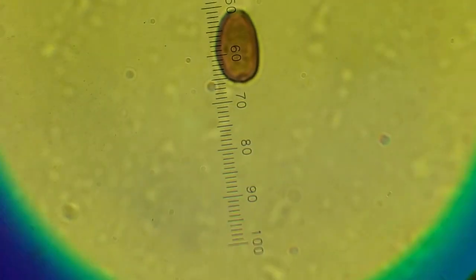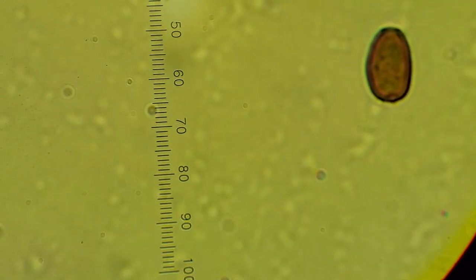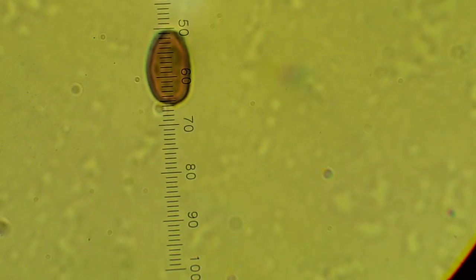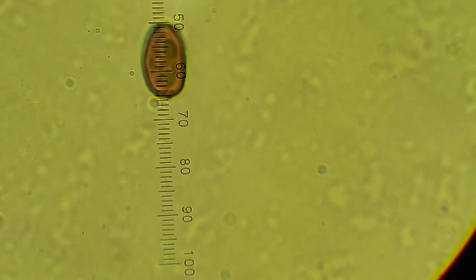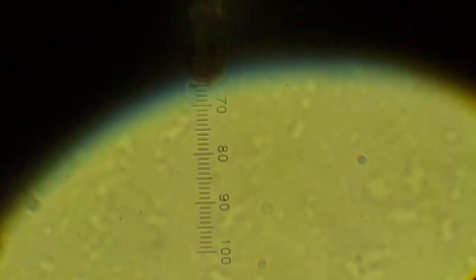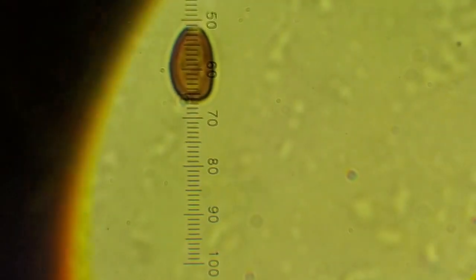And then you would move your spore so that it is in line with your micrometer. And then you can measure. Now obviously when you're doing this yourself, you can do it much more carefully, but this is roughly around 15. It's around 15 microns.